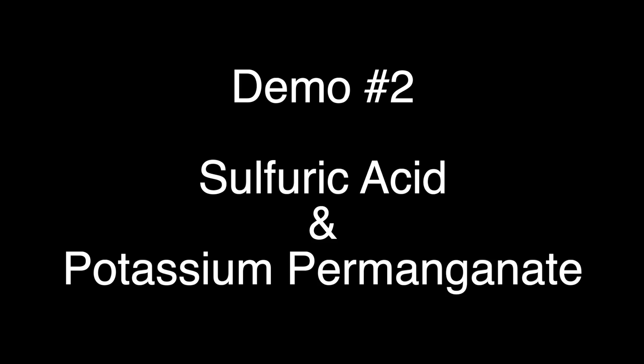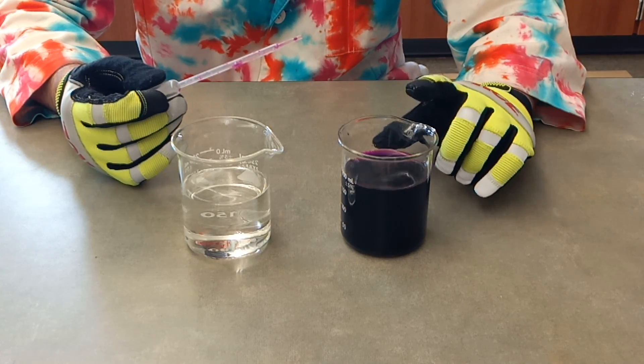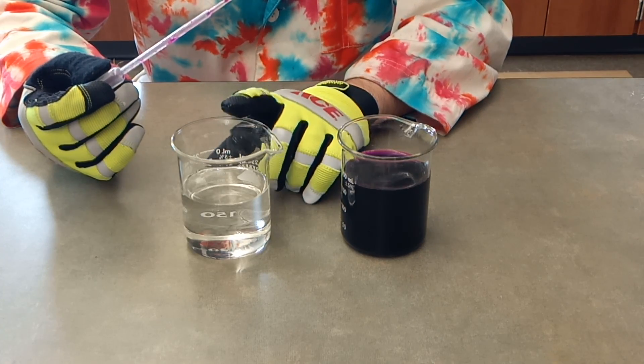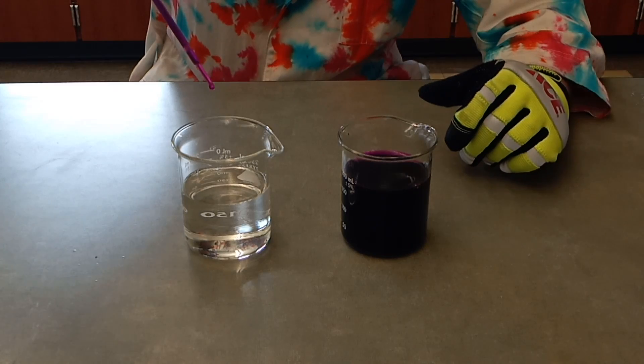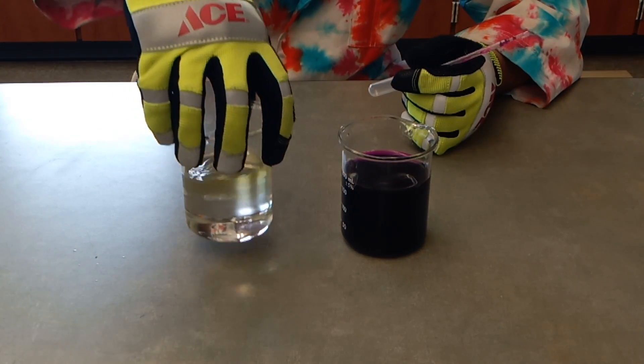There we go. There's potassium permanganate solution in this beaker, and this beaker has a high concentration of sulfuric acid. That acid can react with the potassium permanganate and make the color disappear.